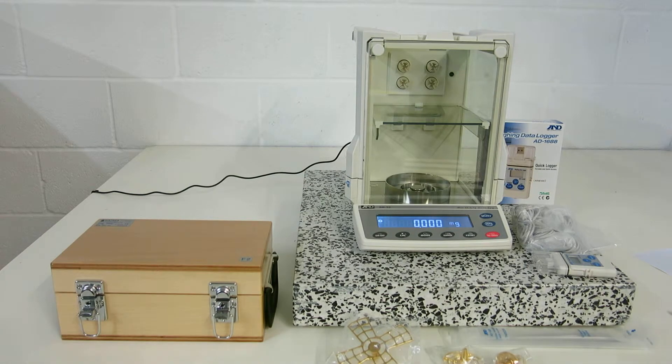This is Nick Edmund, Richmond Scientific, just demonstrating the BM-22. This is an A&D balance, Japanese manufactured.